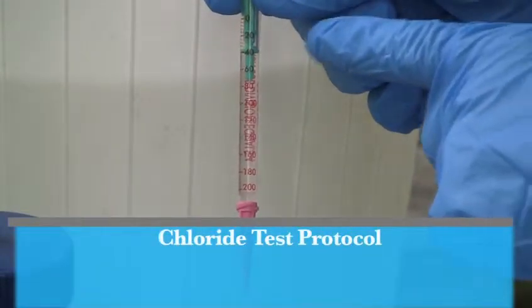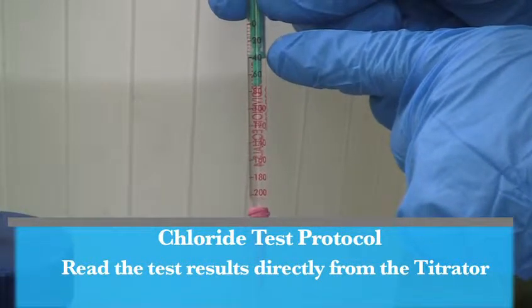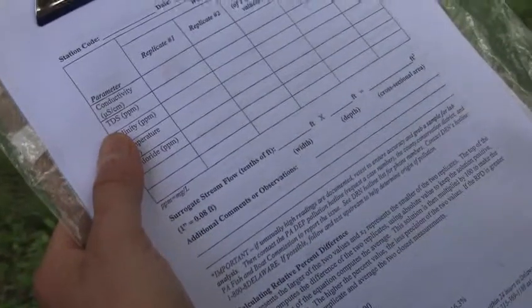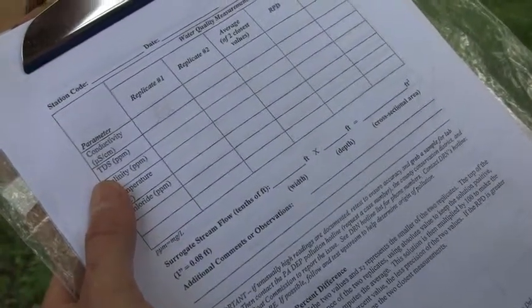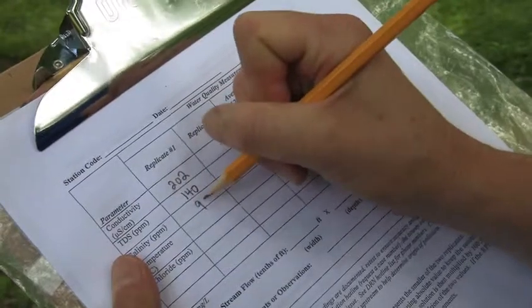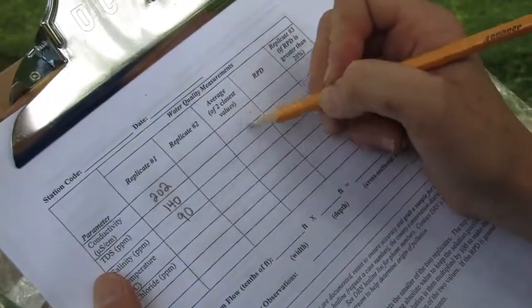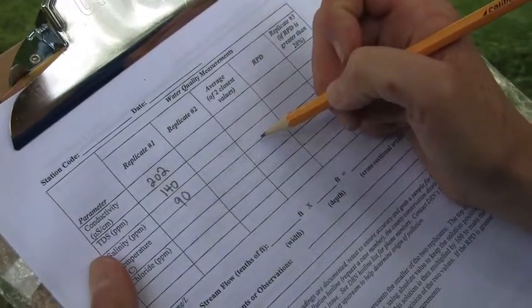After the titration and the color change, you're going to do a direct read on the titrator. You'll see here that the result is 40 parts per million of chloride. Record that measurement on the datasheet. Be sure to record your data results on the Delaware Riverkeeper Network datasheet. Also be sure that you do a second reading and a second replicate, and average the two readings together. This is a quality assurance, quality control step, and ensures that our data is rigorous.